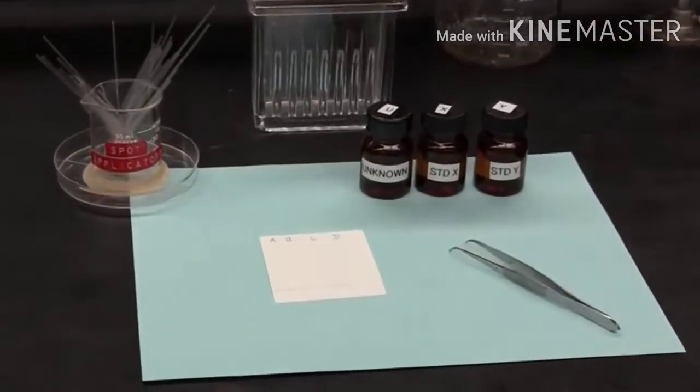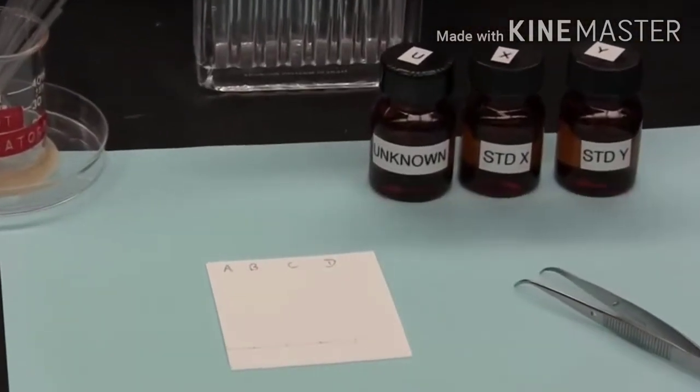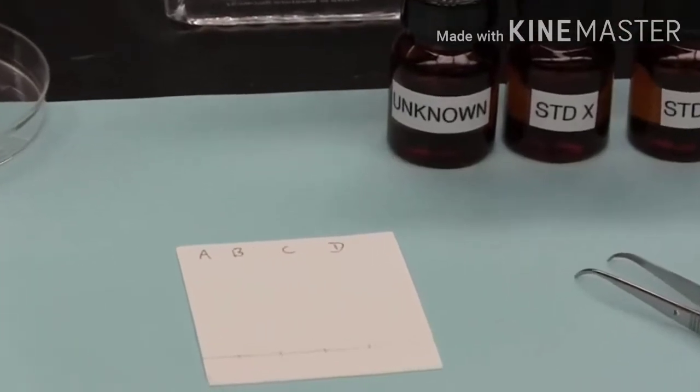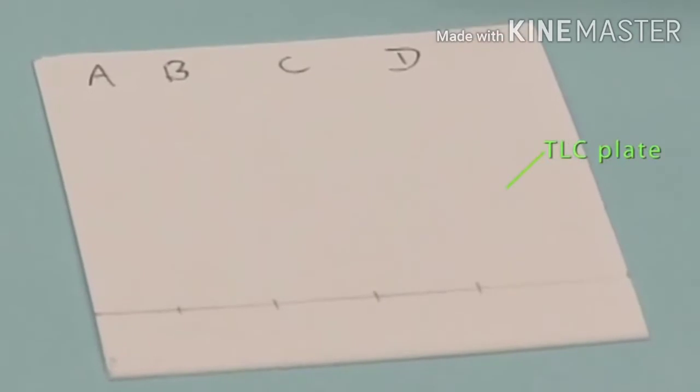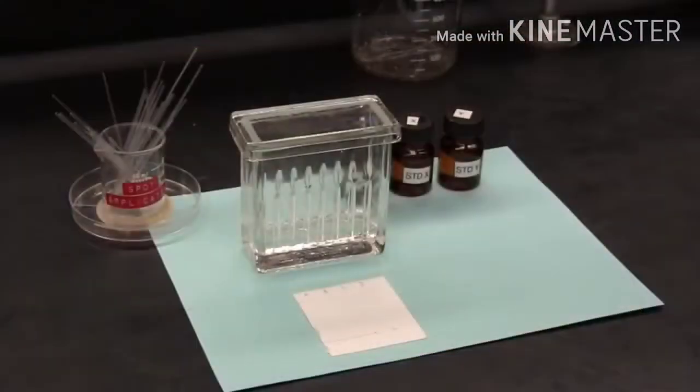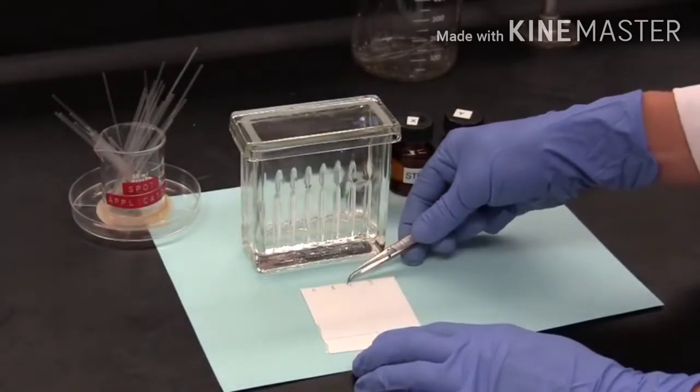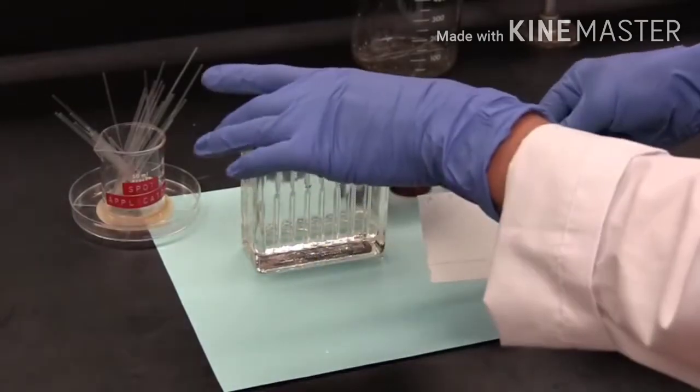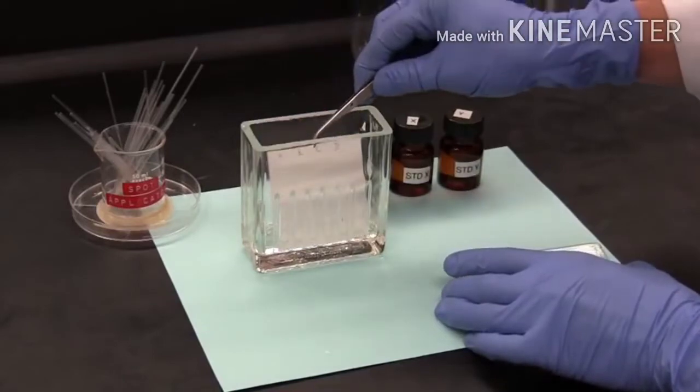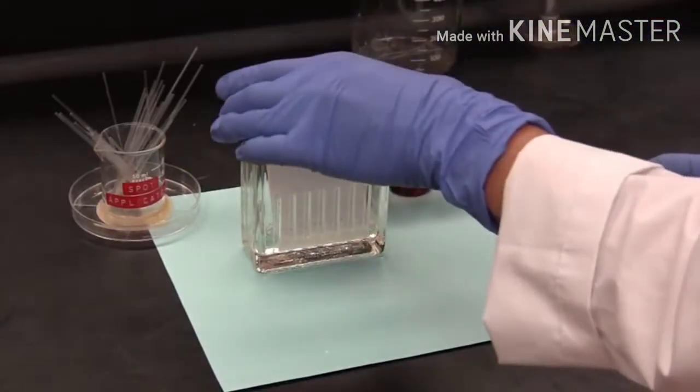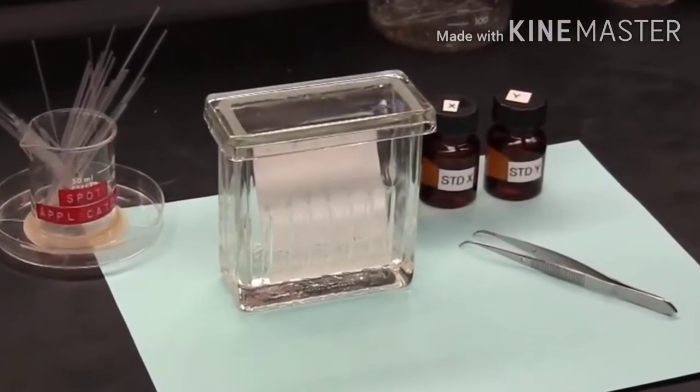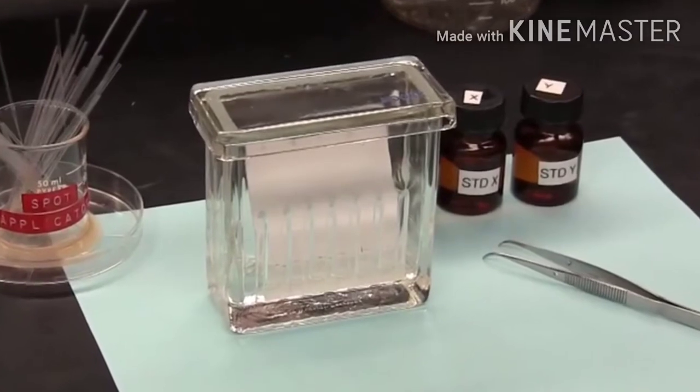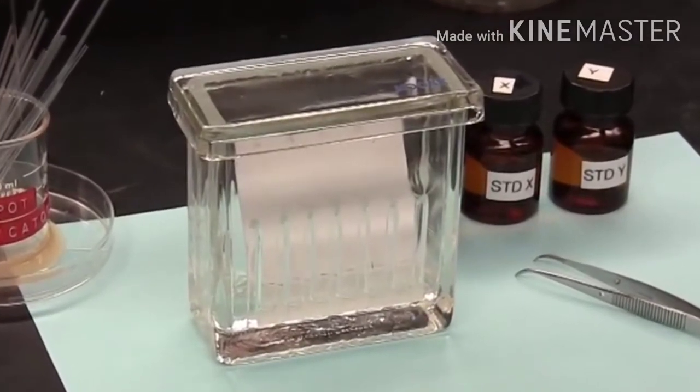Separation occurs on a thin layer of silica on top of a solid support such as a sheet of glass or a sheet of plastic as seen here. This is called the TLC plate. The properties of the silica and the properties of a solvent are used to draw the components up the plate. Differences in the properties of the components in the mixture mean that each component will travel up the plate at a different rate. This causes a separation. The separated components can be identified by comparing how far they travel along the plate relative to reference material, also known as standards.